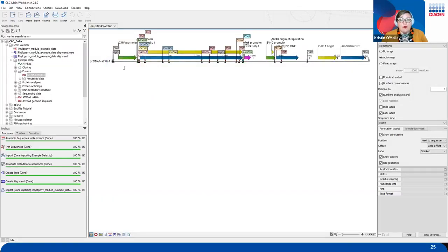So very simply, on this black line that shows up below these annotation arrows, we can highlight the section that we would like to stick this primer in. So for instance, let's select this area on this line to pop the forward primer in. You'll see that the selection turns bluish purple.